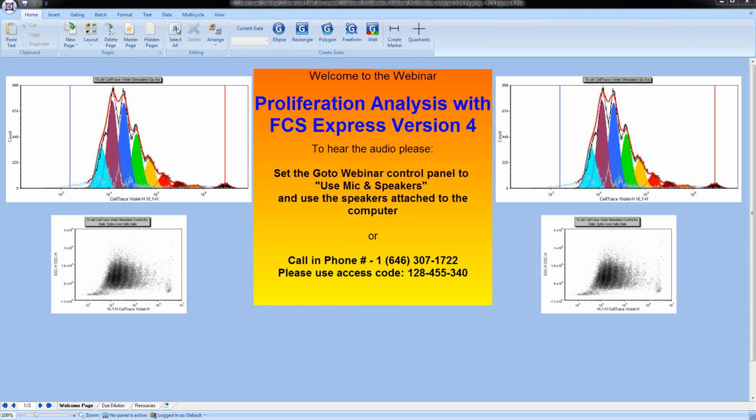We're going to be discussing proliferation analysis with FCS Express version 4. So we're going to take the next half an hour to give you a brief overview of what proliferation analysis is, how it can be accomplished and modeled in FCS Express, and how you can use FCS Express to make the analysis of your proliferation data a little bit more simple, a little bit more easy to use, and get results quickly and easily.